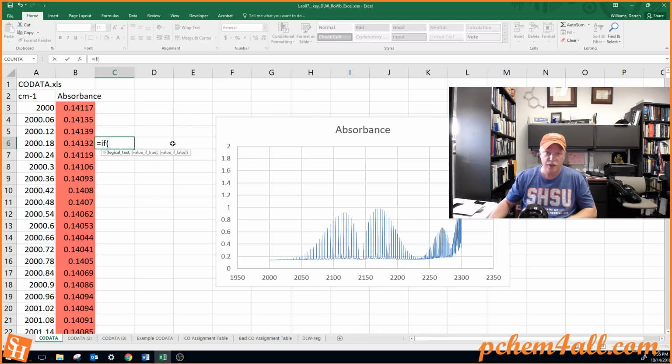If this number is equal to the maximum in these 7 data points, then tell me it's a maximum. Otherwise, keep your mouth shut.